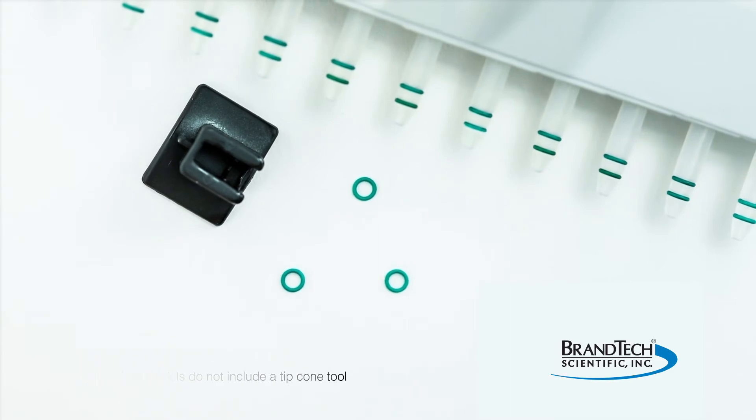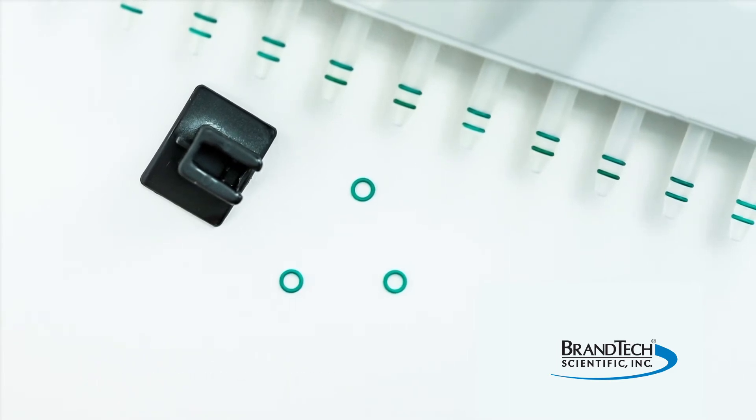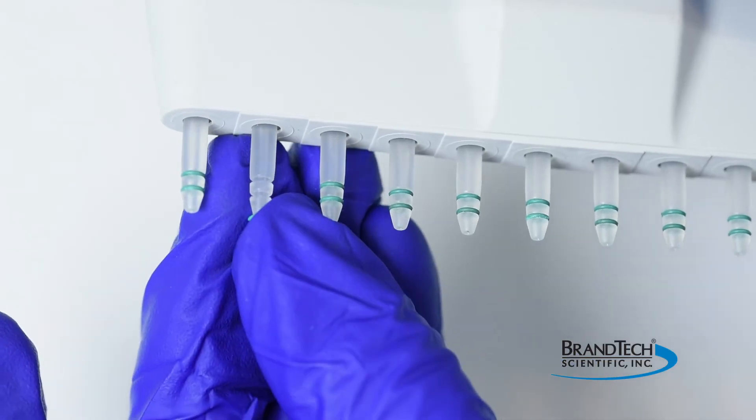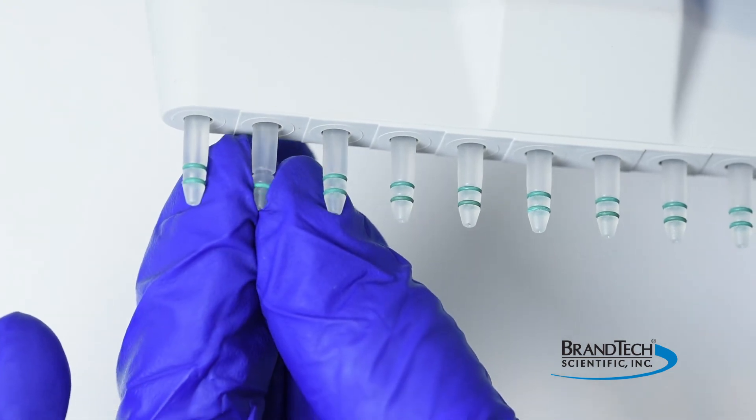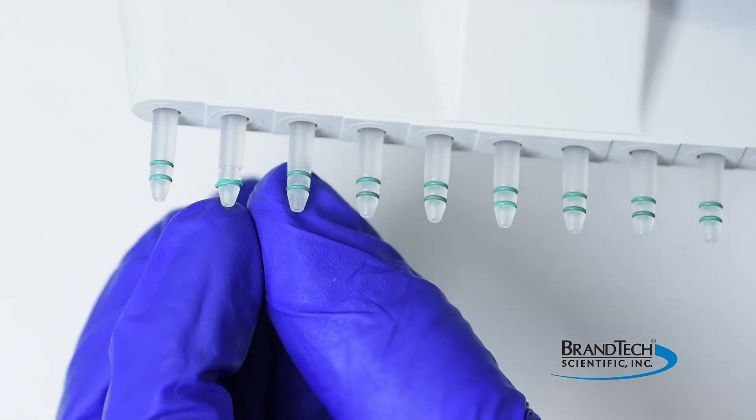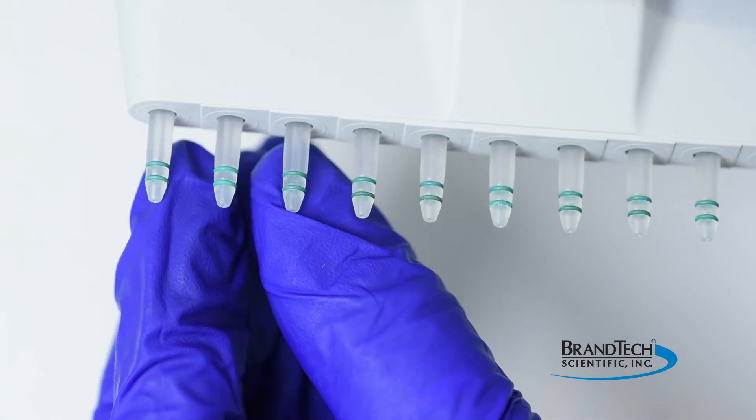To attach O-rings, simply roll the new ring onto the tip cone. With dual ring design, the first ridge will be populated, then the second one will be moved over the first to populate the second ring space.